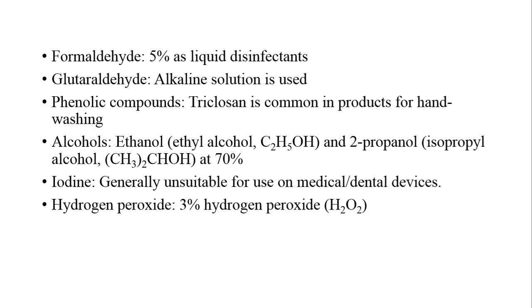This is also very dangerous and very effective disinfectant. However, it causes skin irritation and eye burning, therefore it is not very much recommended. Glutaraldehyde can also be used, which has similar kinds of side effects. However, this is also a very potent disinfectant. Phenolic compounds like triclosan are common in products for hand washing. Like you are using in Dettol, Savlon, they all have phenolic compounds like triclosan, right?